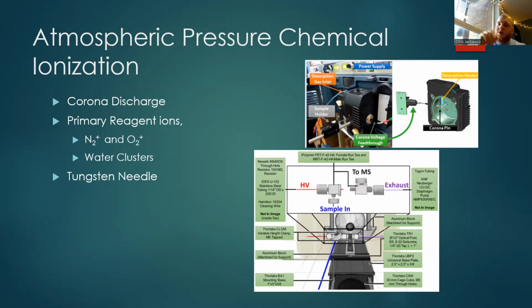It is exciting the molecules around it, and in very simple terms, staying surface level on this idea, water clusters come from that corona discharge, the corona pin, electrifying the water molecules around it in the ambient atmosphere, and using that as a sort of ionization media for our sample to be ionized through and taken into our instrument here. Some really interesting stuff, great applicability into ambient atmosphere analysis.